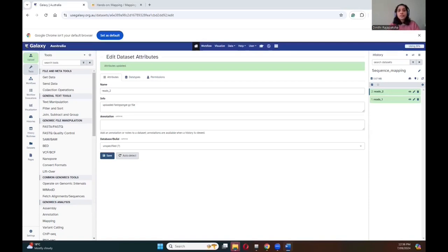Since the data we are using today comes from C57 black mice, we'll be using the MM10 reference genome. Remember that different species and experiments will require different reference genomes, so when using this workflow for future analysis you can select the appropriate reference genome based on your experiment. For the analysis, there are several tools you can use for mapping, but today we are going to work with Bowtie2.